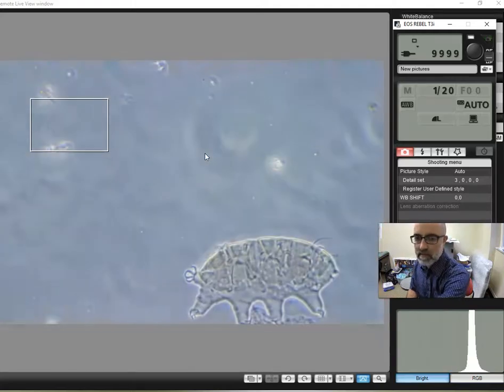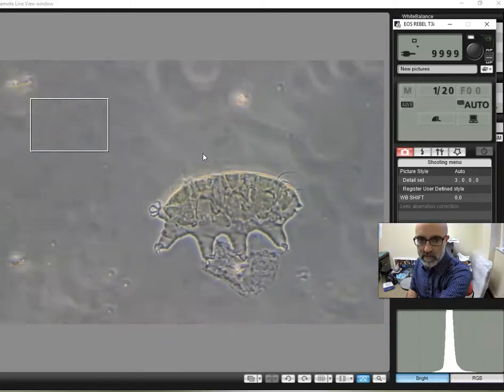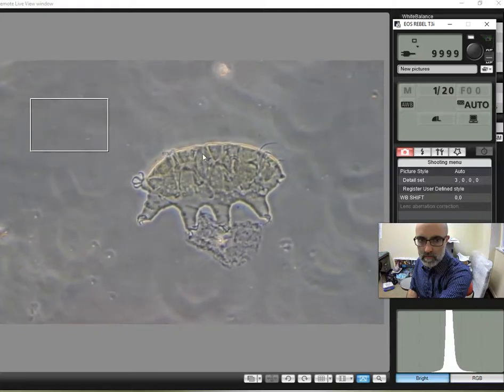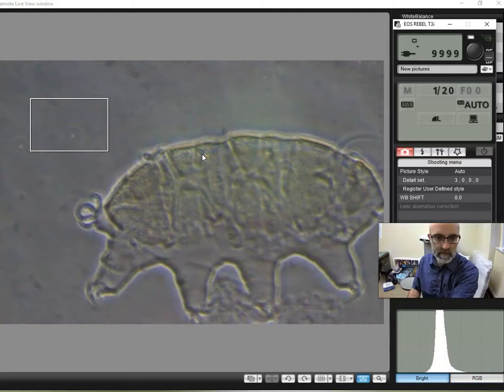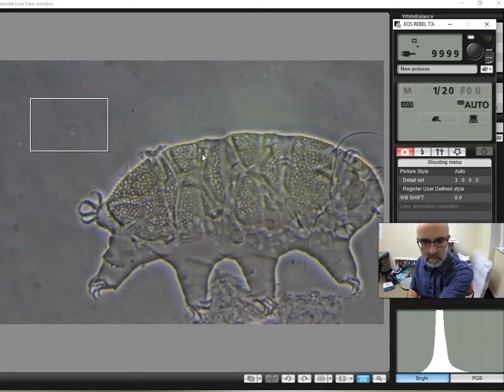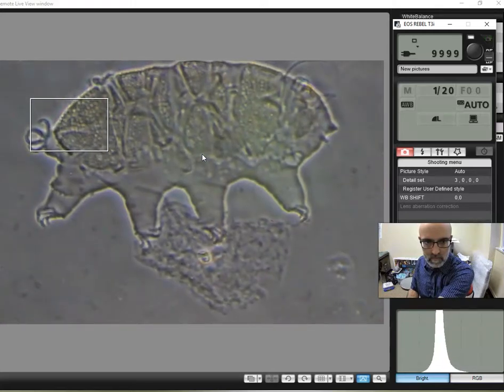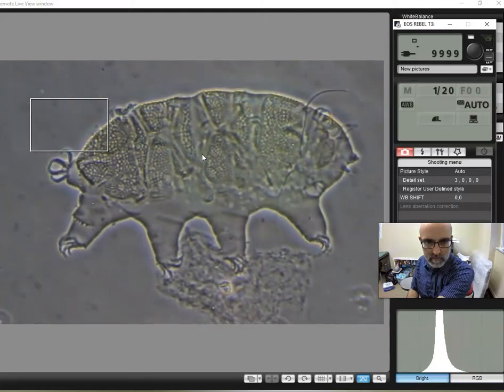So I'm going to go back out and recenter it. Yeah, there we go. Oh, there we go.